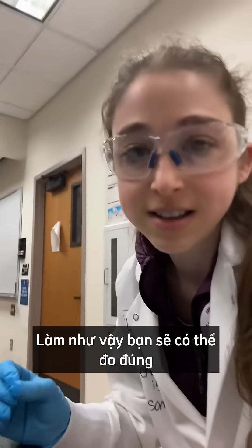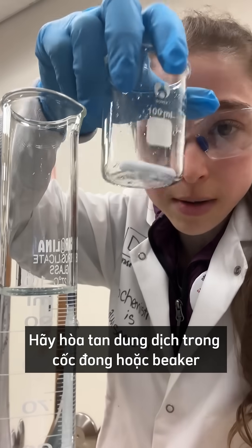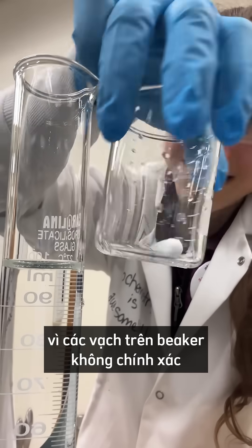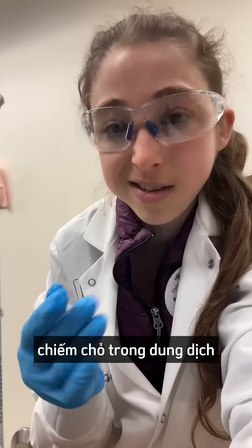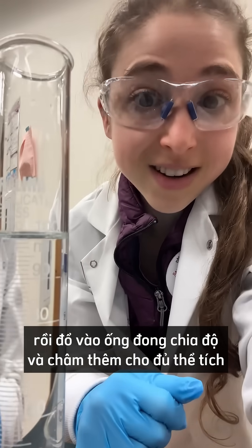This lets you keep things accurate. Do your dissolving in a beaker — not measuring — these lines are not measuring lines. Do it in a partial volume, taking into account that solids take up space, dissolve it fully, pour it into your graduated cylinder, and then top it off.